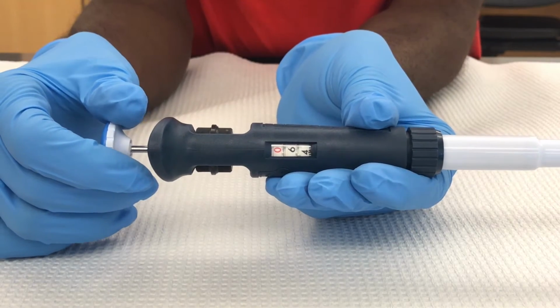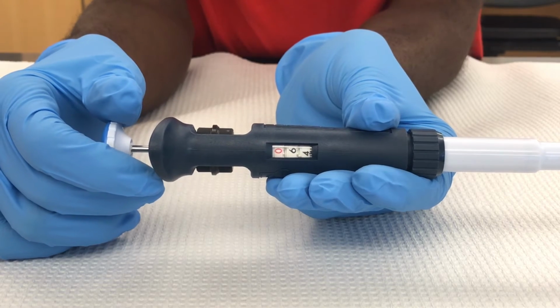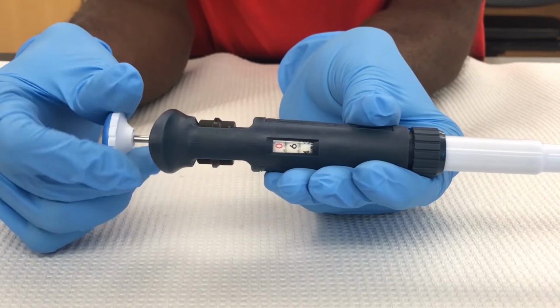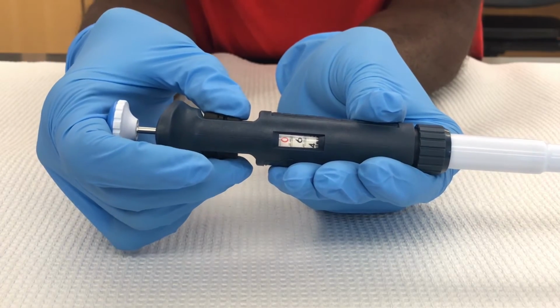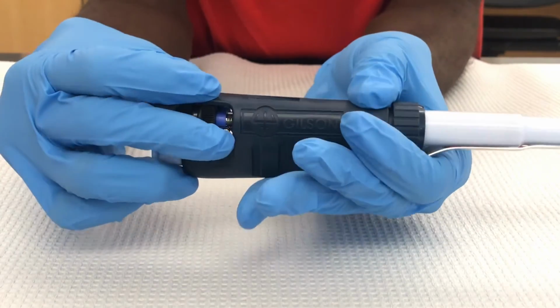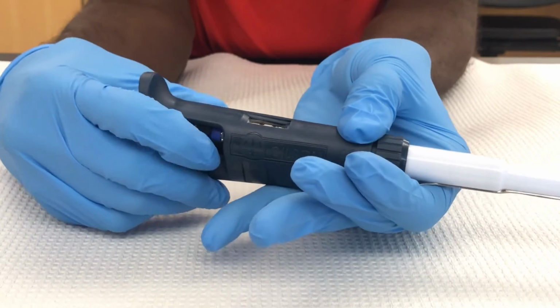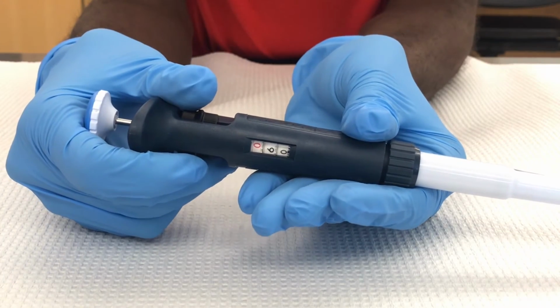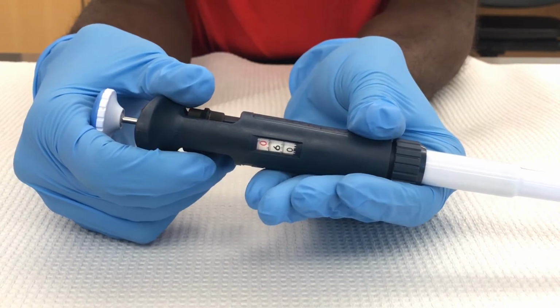For this demonstration, we'll use the P1000 pipette. Set the desired volume by carefully turning either the dial at the top or the black volume adjustment ring at the body of the micropipette to the appropriate volume. This micropipette has now been set to 600 microliters.